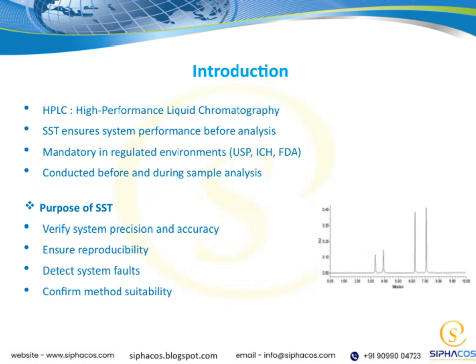As part of the introduction, it's important to remember that SST is a key quality control step, especially when working with HPLC or high-performance liquid chromatography. SST makes sure the system is performing optimally before we start our analysis, which is vital for obtaining valid data. In regulated environments like USP, ICH, and FDA, SST isn't just recommended, it's mandatory. It needs to be conducted both before starting the analysis and periodically during the process. This ongoing check helps maintain the integrity and accuracy of our results throughout the analytical run.